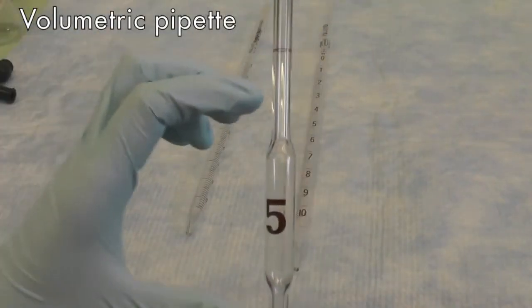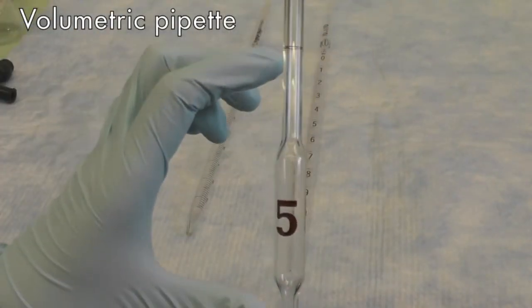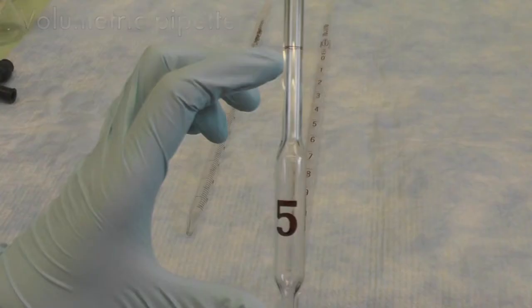Volumetric pipette comes with a distinct shape and it only delivers one fixed volume. It does not require the last drop of liquid to be blown out for accurate volume delivery.